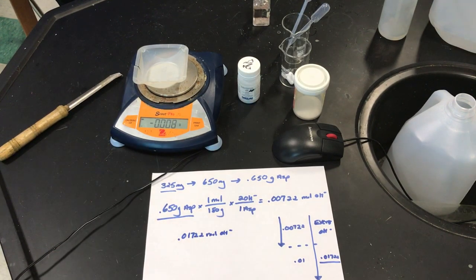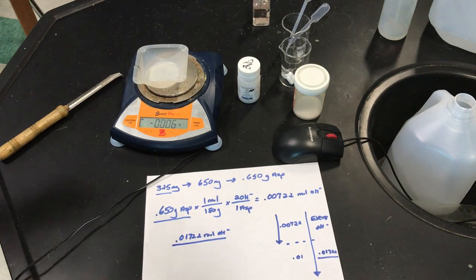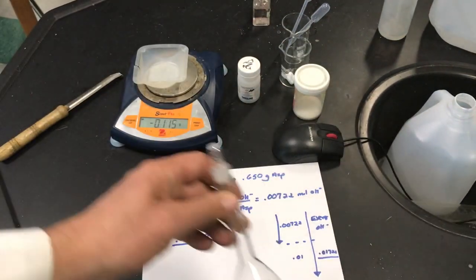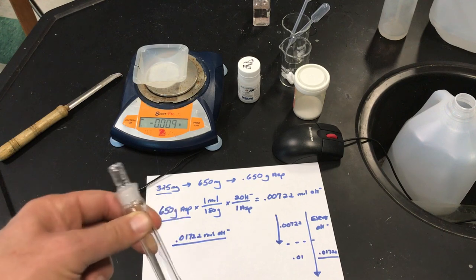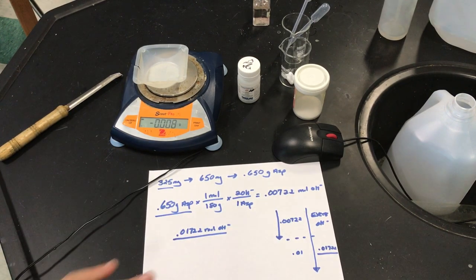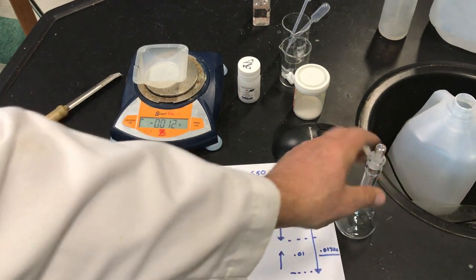Now I've got to make a solution. To make a volumetric solution, we need a volumetric flask. The volumetric flasks we're using are 100 milliliter flasks, so we're going to make 100 milliliters. I want to use some of it to standardize and some to deliver the excess amount to the tablets, and then eventually titrate back. I want to make 100 milliliters total.